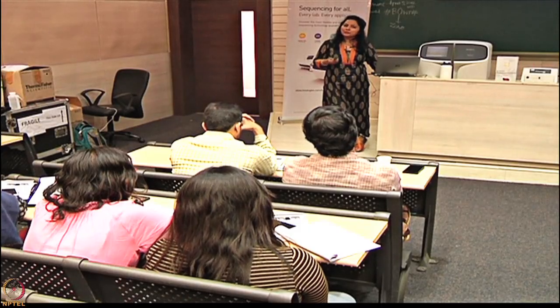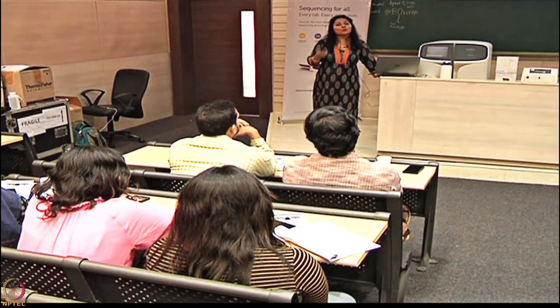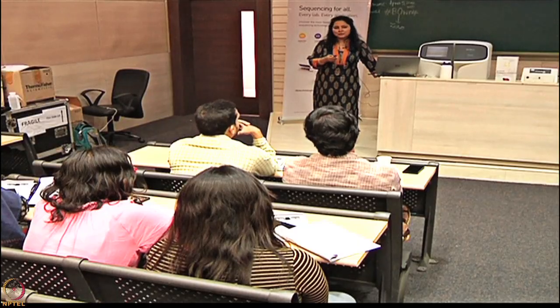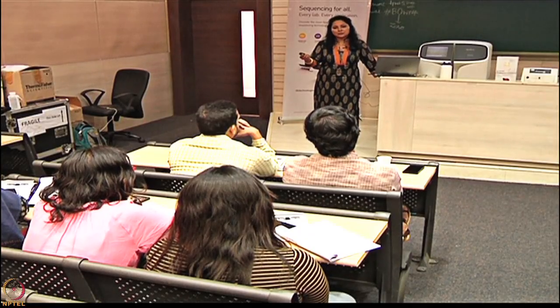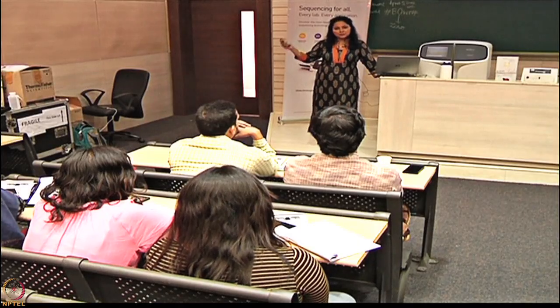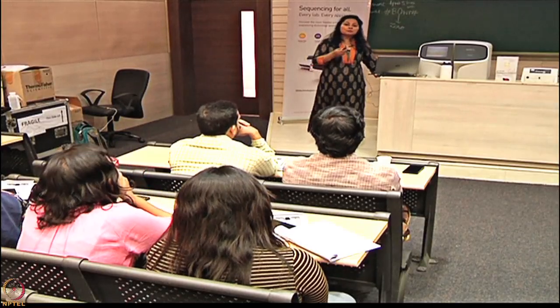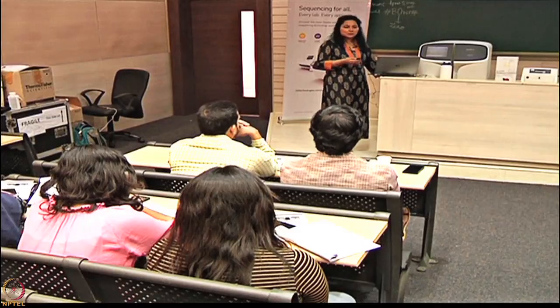So people do a lot of different kinds of experiments. Now what you would look out for in your NGS is that the data requirement for all these experiments is very different. So when you are doing a genome, it's a very straightforward calculation that you generally tend to generate 100x data. So whatever is the genome size, you multiply by 100. There are definitely ifs and buts around it. We'll not go into those details. But the data requirements for these different kinds of experiments are very different. So that is where you need that flexibility, that a single NGS system can cater to all those requirements.